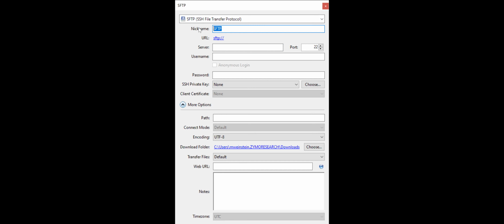We're going to change the nickname to Hoffman 2 home. In my case, I'm calling it Hoffman 2 home class because I already have a Hoffman 2 home link and that'll get confusing. The server is going to be dtn2.hoffman2.ucla.edu. The username is going to be your username.